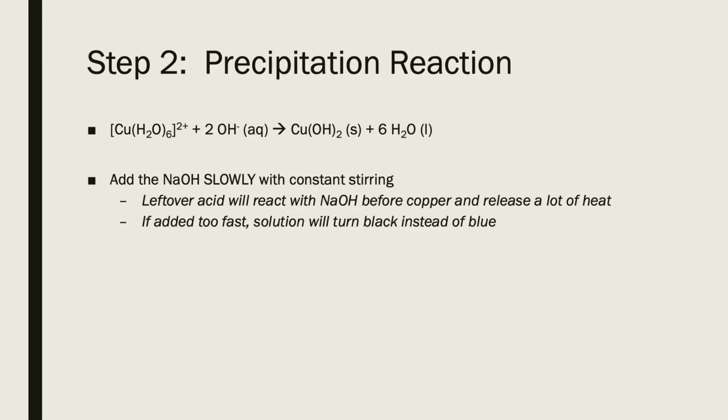So if you get that on your skin, you will probably also know, although it won't feel quite the same. What usually happens with a base is your skin will start to feel a little bit slippery, almost soapy, mainly because the sodium hydroxide is basically turning your skin into soap. And so if you feel your hands get slippery at this part of the experiment, just go to the sink, wash them off good. It shouldn't be that big of a deal.